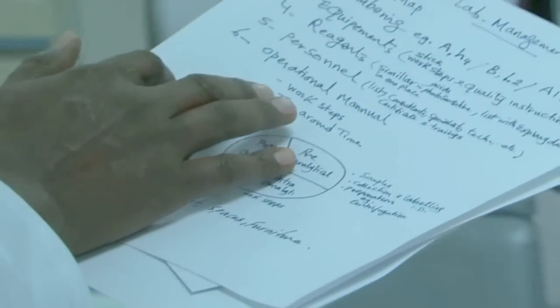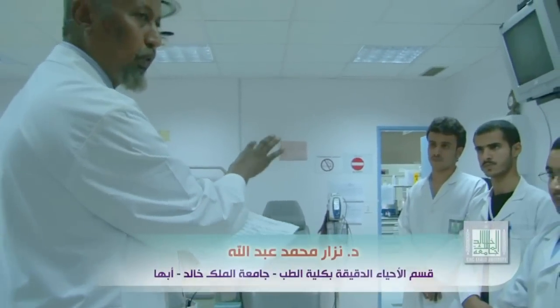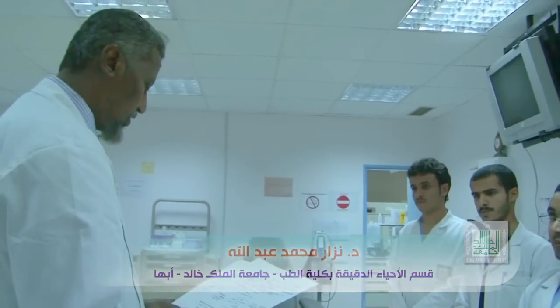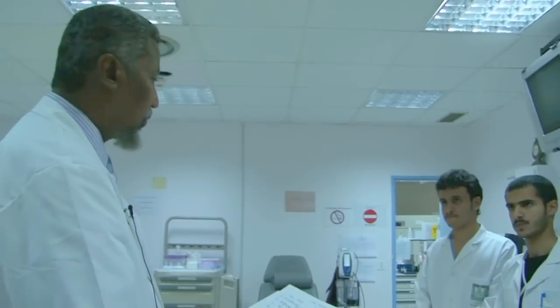Now, the post-analytical steps, which is important regarding the reporting of analysis, I mean the results. So how you report your result? Is it a hard copy on a form, or in software? You put it in your computer, so you keep it in your records for longer time, and you can retrieve your results.